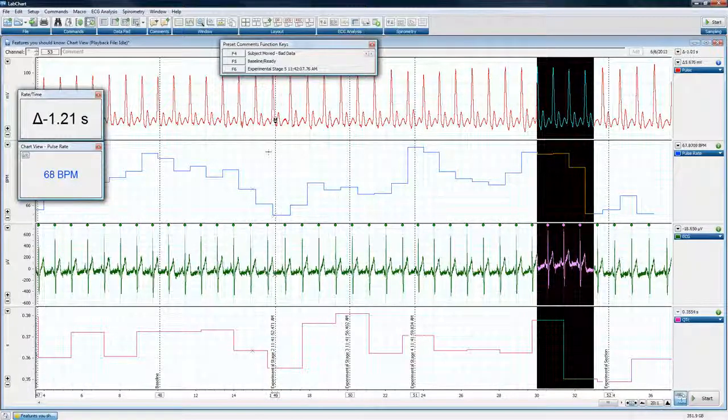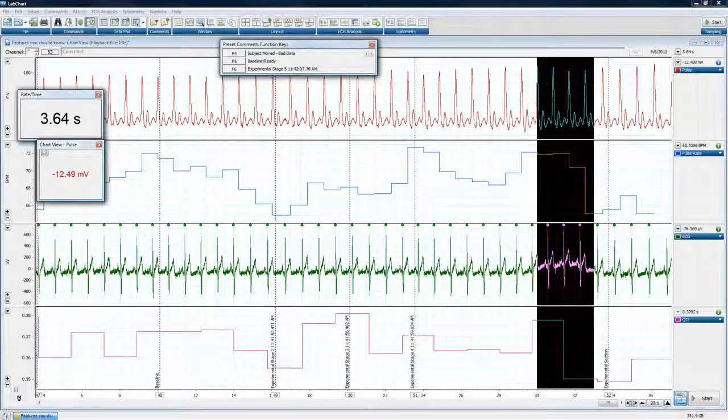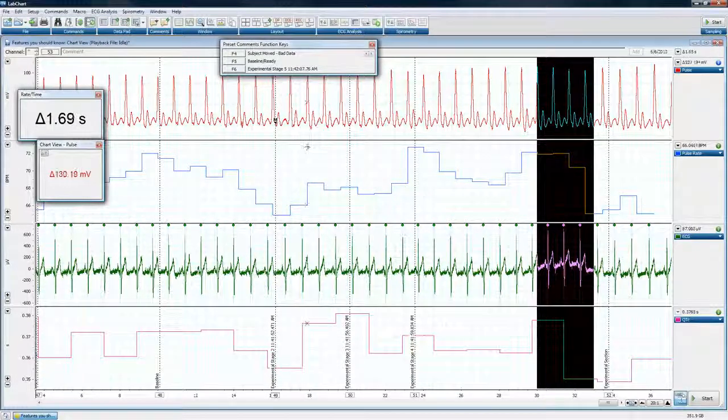That will place the marker exactly on that point. And so if you're hovering your cursor over everything, the marker is placed exactly on that point, and therefore you can know exactly where it is. And when you get the deltas in relationship to your live data where your cursor is, you know it is exactly the difference between where the marker is and where your cursor is. Or the exact difference between where the comment is and where your cursor is, instead of where you arbitrarily place the marker. So I just learned how to do that.